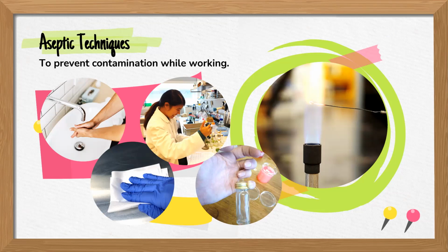Aseptic technique also prevents the microbes from entering the environment, which can be dangerous to the experimenters or others as well.